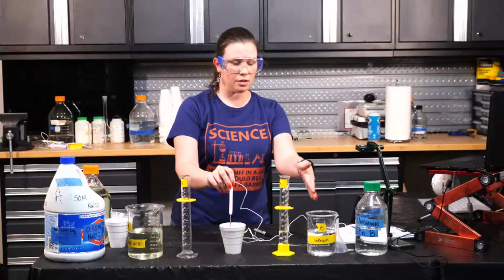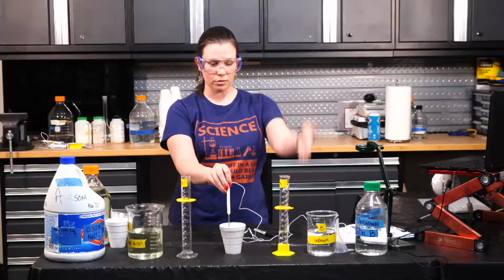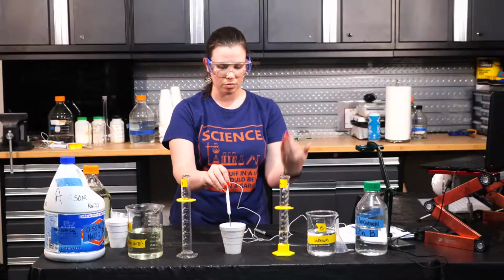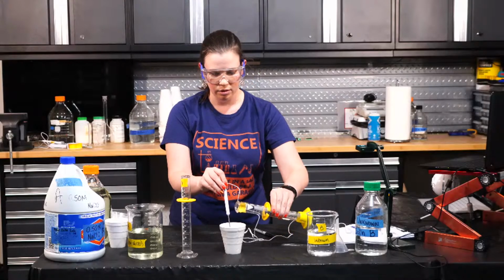Now, unknown B has been sitting at room temperature for the same amount of time as the bleach, so it would also be at 19. I don't want to pre-mix the solutions. I want to see the heat all at once. So here we go. We're adding unknown B.